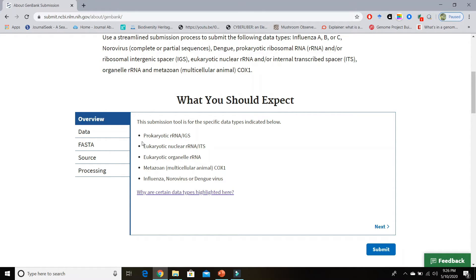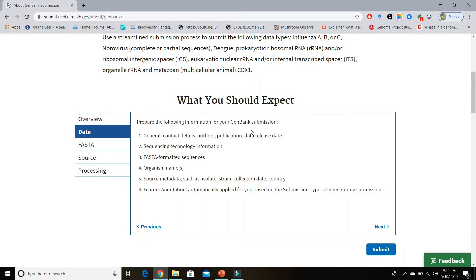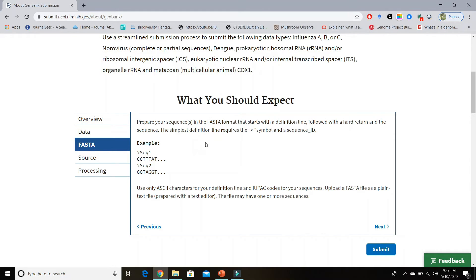This submission tool is for the specific data types indicated. If you go to the data section you will see the GenBank submission information required during your submission process — you need to prepare general information, contact details, authors, publication data, release date, and the sequencing technology you used for generation of your sequences. Importantly, GenBank only accepts sequences formatted in FASTA format, so you need to format your sequences in FASTA form. During submission, the tool will ask for the organism name and more information such as isolate, strain, collection date, and country.